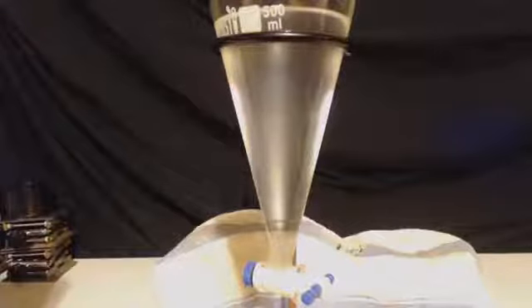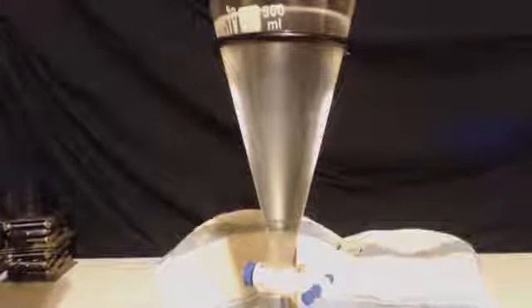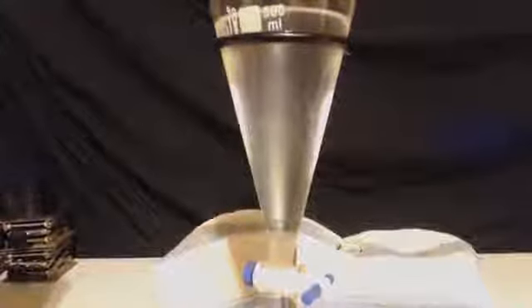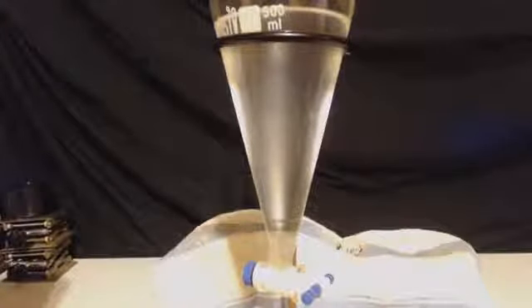Yeah, the second half of the azeotropic distillation, I went pretty fast, faster than the first one. Still, I went at a decent rate. I mean, it wasn't too fast. I boiled what was left. When I got done, I boiled what was left in the pot, meaning the high boiling non-polar stuff. And I couldn't get anything to come over until 120 degrees Celsius. So that must be the next thing in there that came over with the methanol. Probably formed an azeotrope with it.